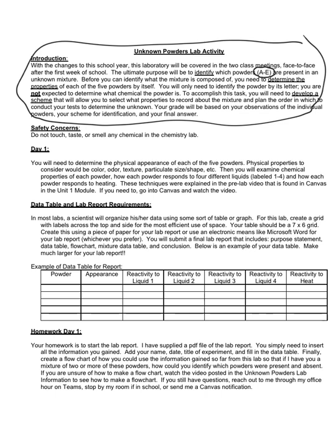Once you know those properties, then when you are given a mixture, because it's a physical mixture, because they don't react with each other, powder A, if it's present in the mixture, its properties are still there. However, the difficult part is that the other powders are also present, and their properties might mask the properties of the individual powders.